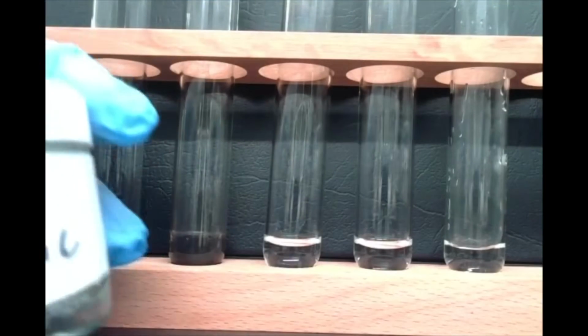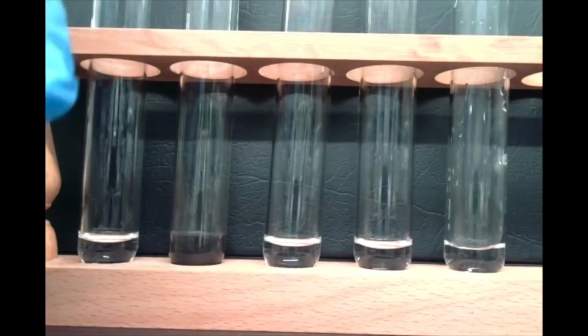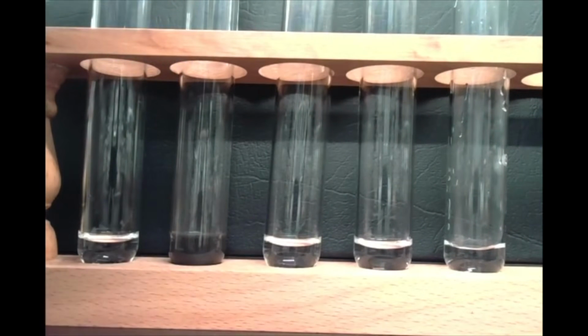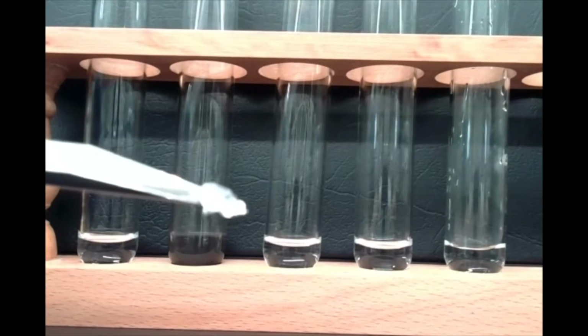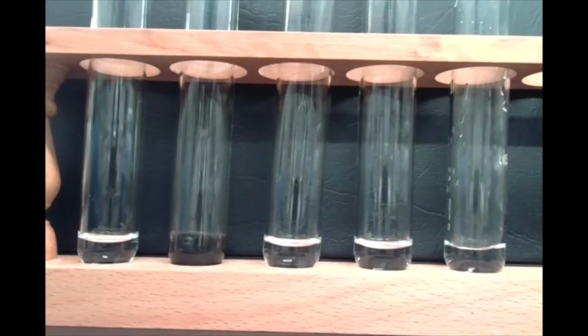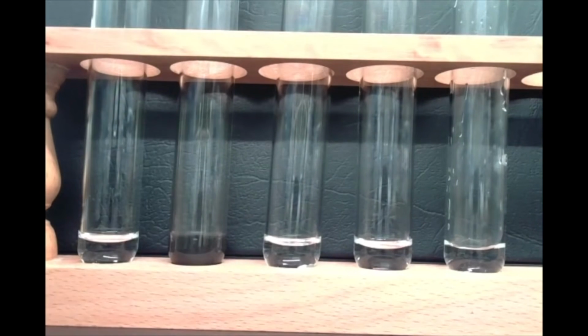All right, to this third test tube, we're going to add our mossy zinc. So again, just take a little piece of this zinc. Probably take this little chunk here. I don't know if you guys can see that very well, but there's a little chunk of that zinc. We're going to add that to test tube number 3. And there we go.